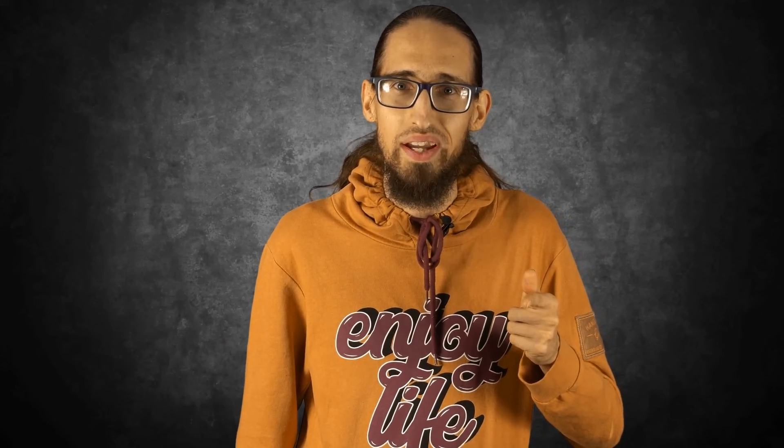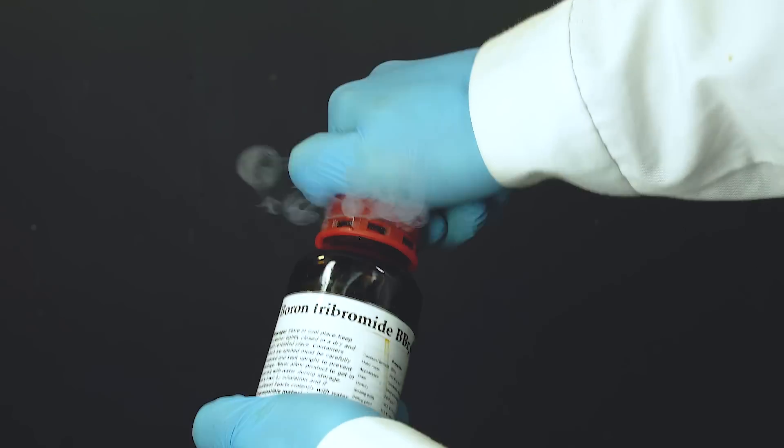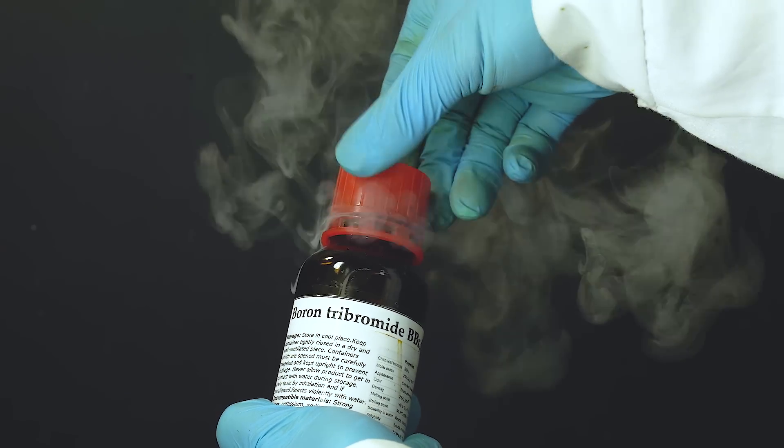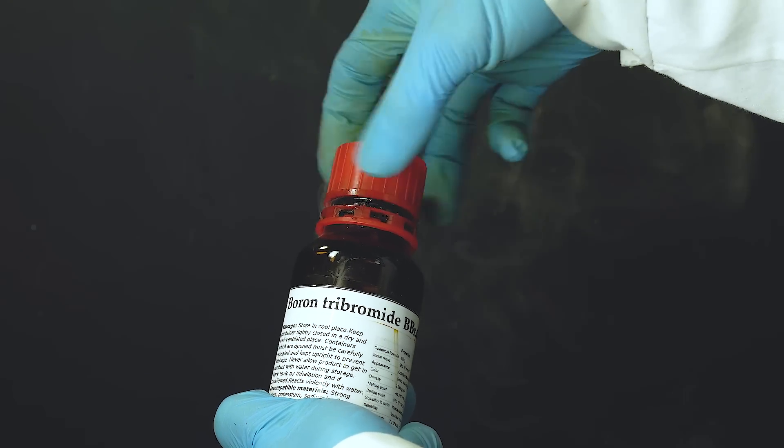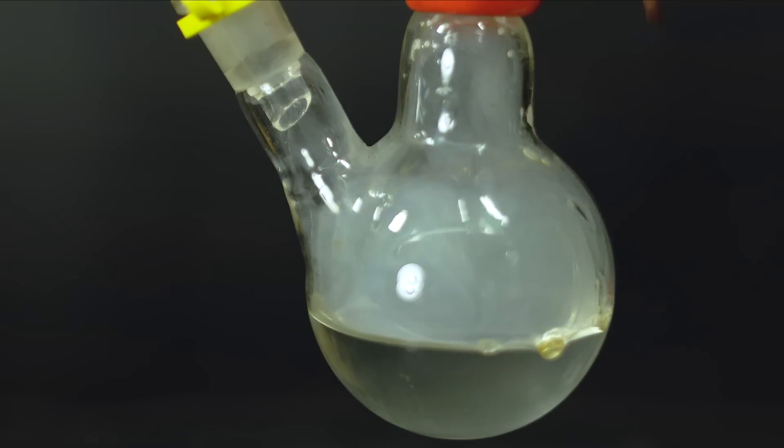As strange as it is, I didn't happen to have hydrobromic acid, so I had to get it. And how do true chemists get their hydrogen bromide? Exactly! Hydrolysis of boron tribromide. Boron tribromide is a fuming liquid compound. It's decomposed by water and forms hydrogen bromide and boric acid.